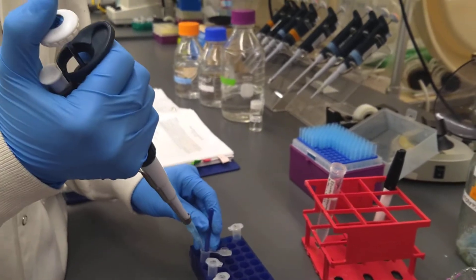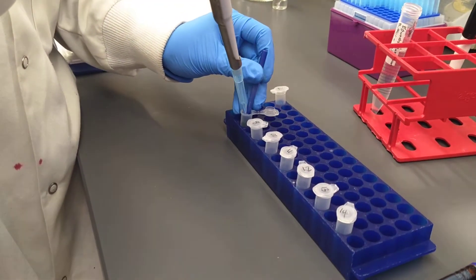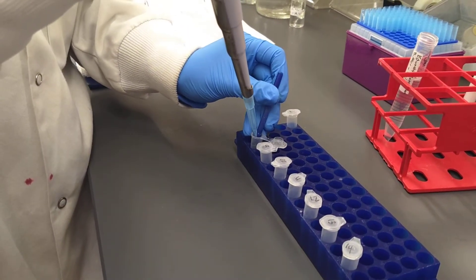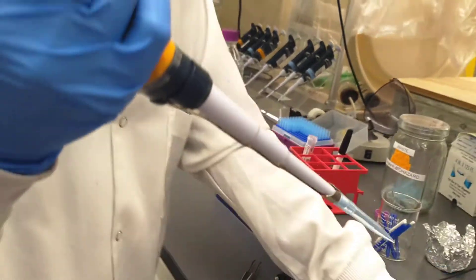As you can see, this is a very simple procedure. After we've ground up all of our samples, we're going to let them sit for an hour at room temperature, and then we proceed with an alcohol wash. And that's it.